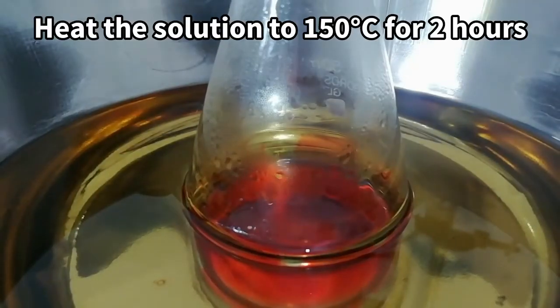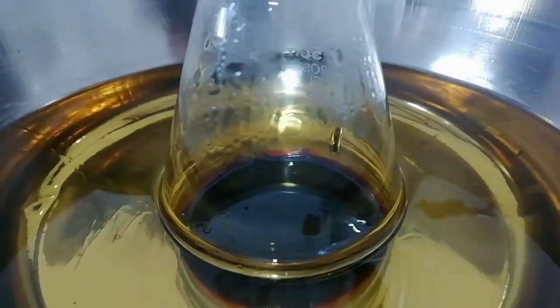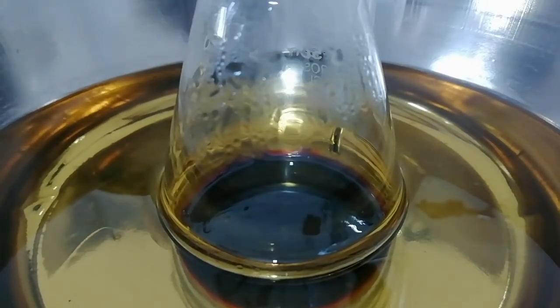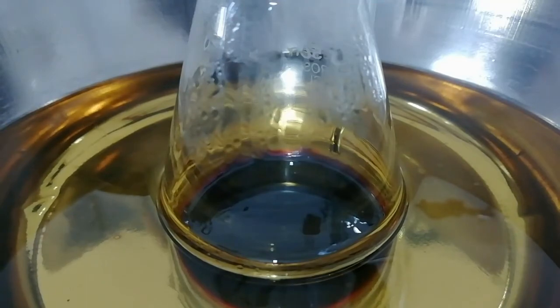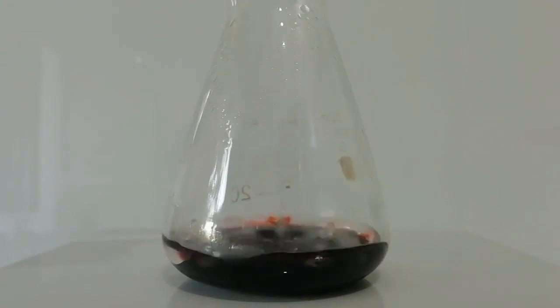Then the mixture was heated to 150 Celsius for 2 hours. During this time period the solution turned to light red, dark red, and finally to black color.